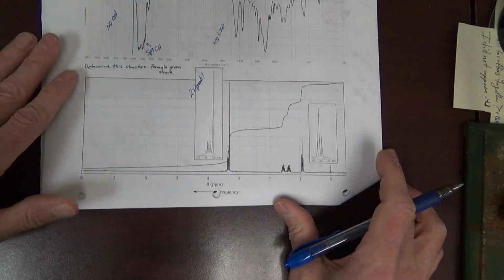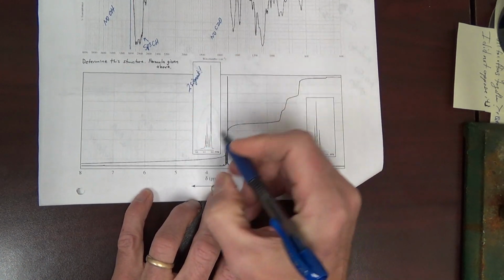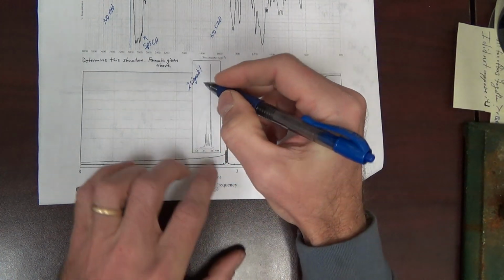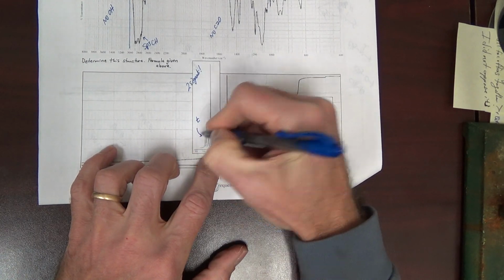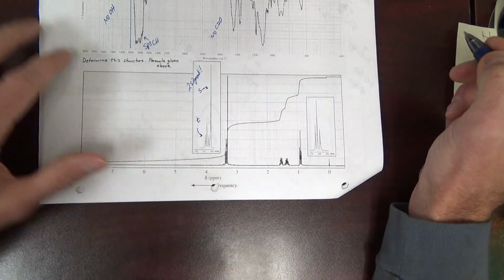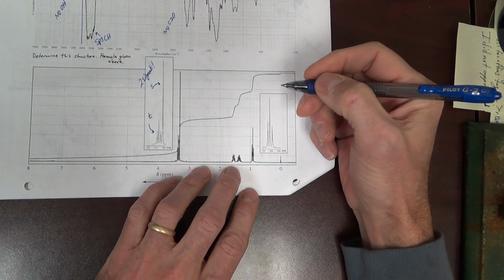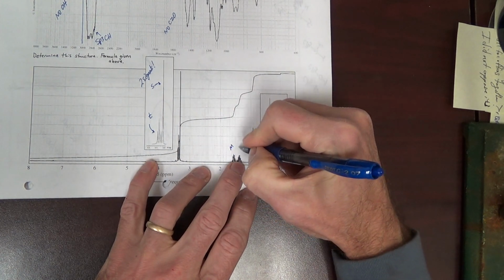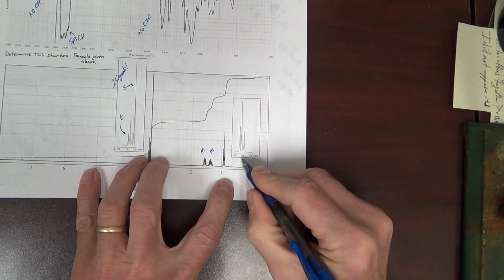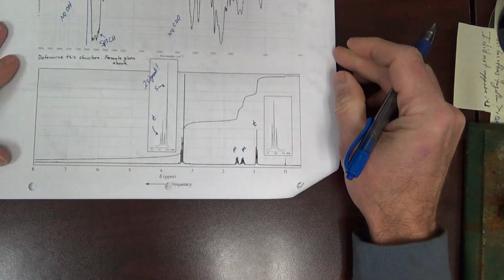Okay, Proton NMR. I mentioned this on one of the previous videos, but this is actually 2 signals here. It's been expanded here. This looks like a triplet. And this is a singlet right beside it. Other signals. Looks like a multiplet, and a triplet. It's been expanded for you here, so you can clearly see triplet.